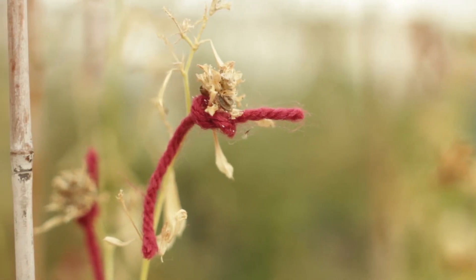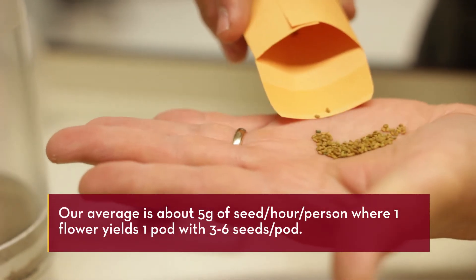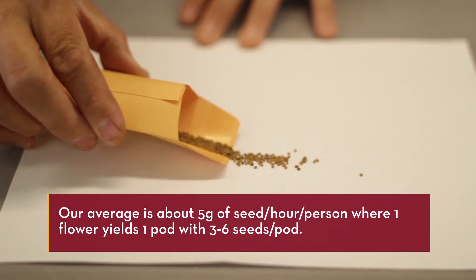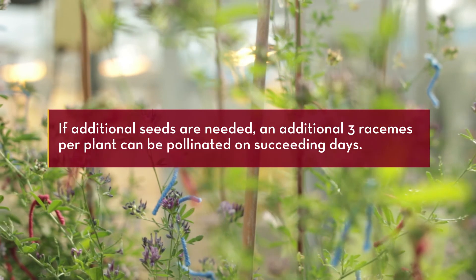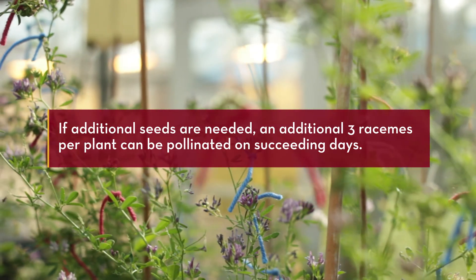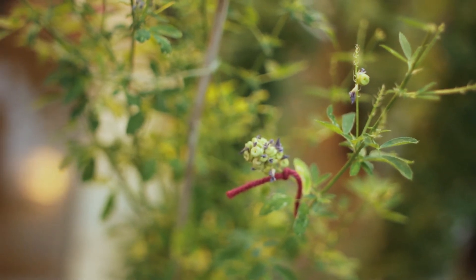Our average is five grams of seed per hour per person crossing, where one flower yields one pod with three to six seeds per pod. If additional seeds are needed, an additional three racemes per plant can be pollinated on succeeding days. Large plants can support 12 to 15 racemes of seed.